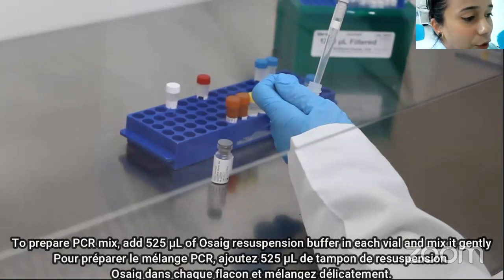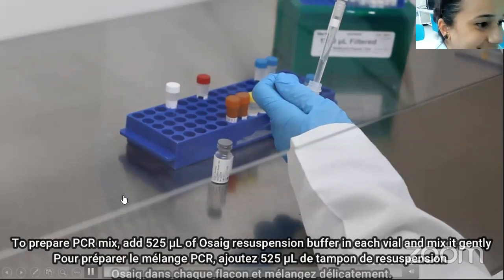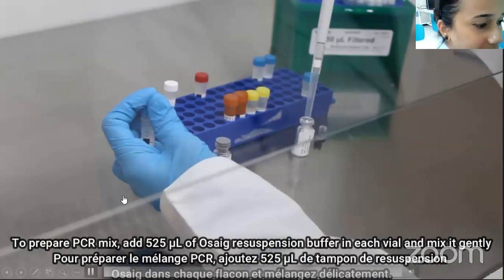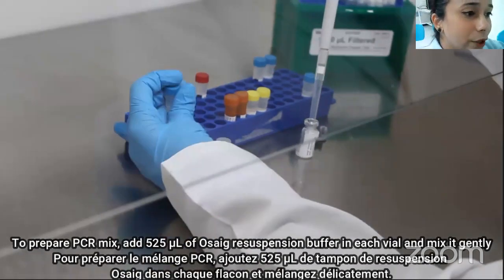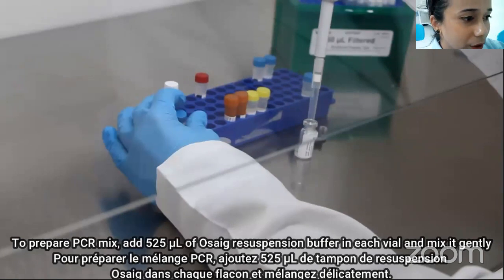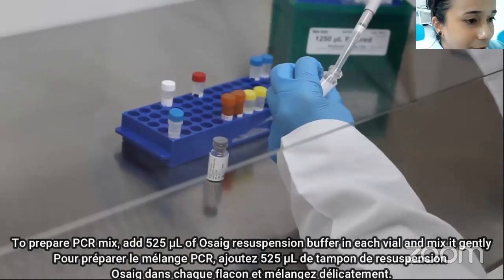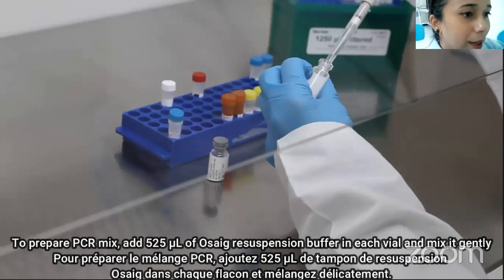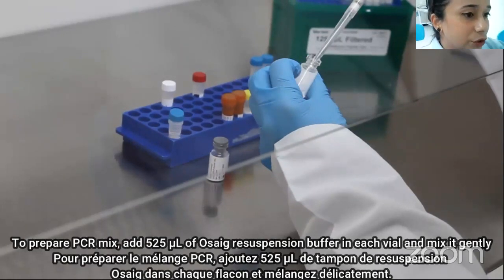So this is how you prepare the PCR master mix. And then you have to prepare both the vials. Both the vials constitute 96 samples actually. The whole kit is for 96 samples. You have to be careful, you have to be gentle while mixing it to prevent any bubble formation or anything.